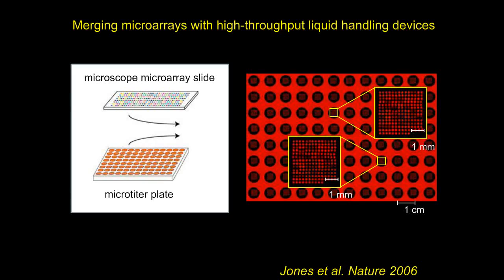So in this context, we combined the previous technology of microscope slide arrays with the microtiter plate technology that's often used to automate through liquid handling robots.